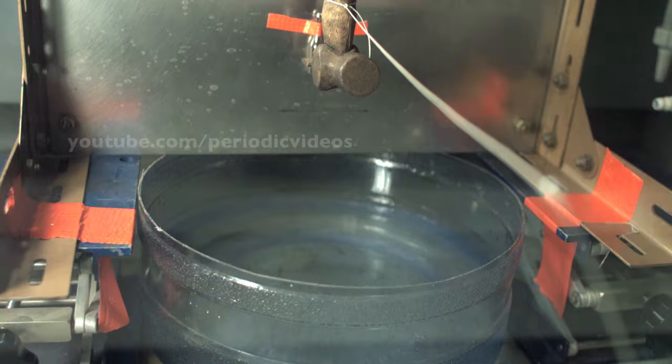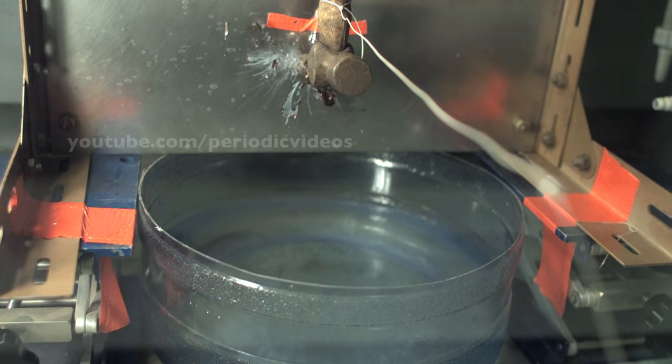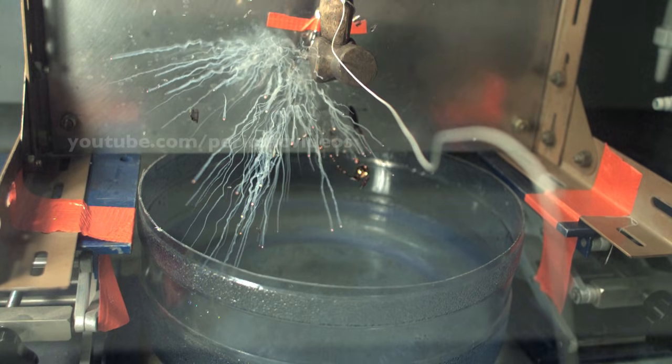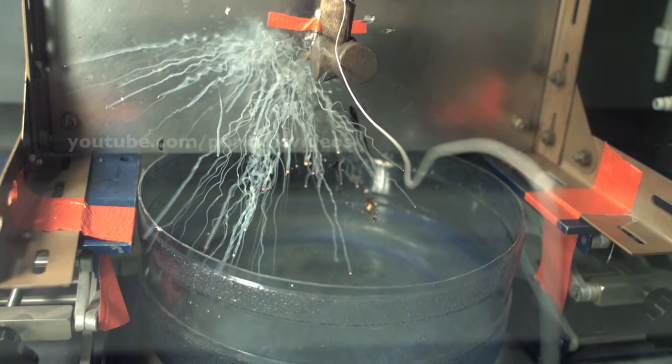When you break the ampoule, the shock of breaking it broke up the caesium into quite a few little droplets. You can see these droplets spreading out and falling towards the water.